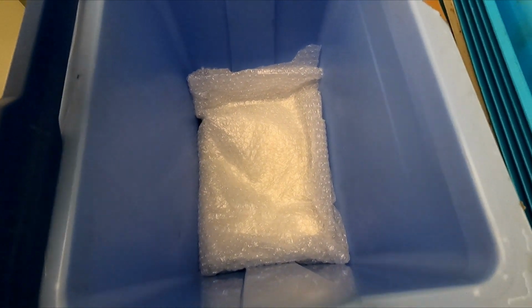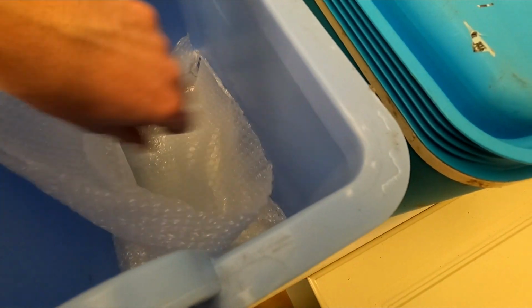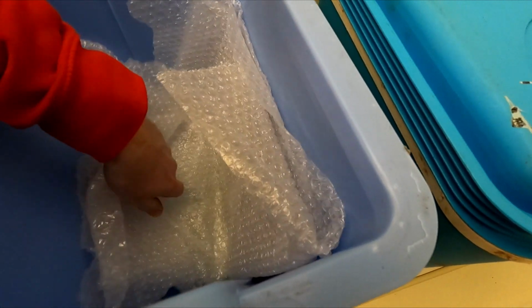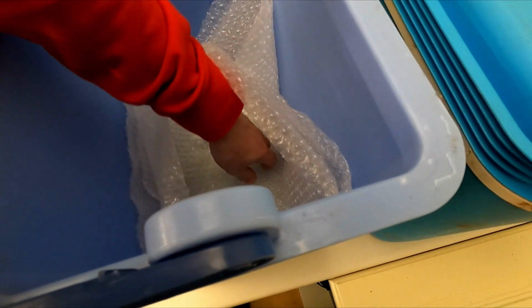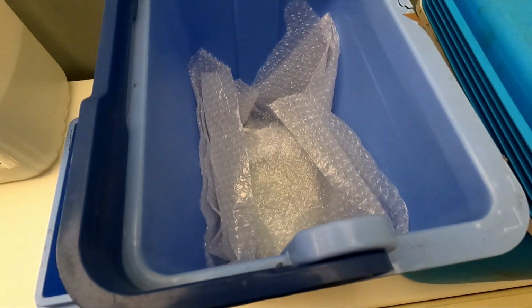Now, the point of this is to just put a form of barrier between the frozen ice packs and the samples themselves. I've doubled this up a couple of times, which is probably a little bit overkill. I think around 2 layers thick tends to be about right. The cool temperature can come through quite nicely, and you've got a little bit of protection up the sides of the sample as well.